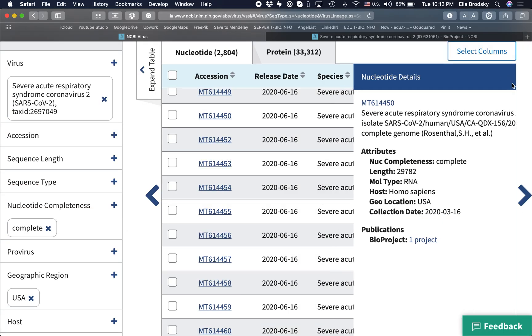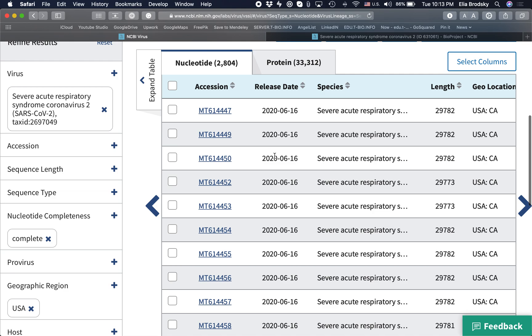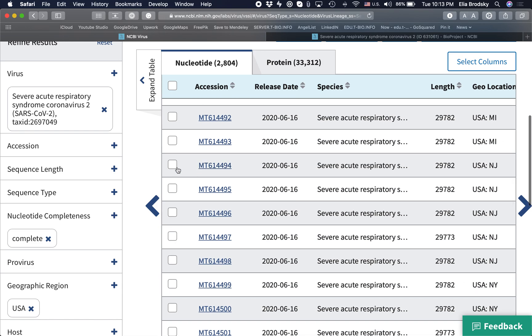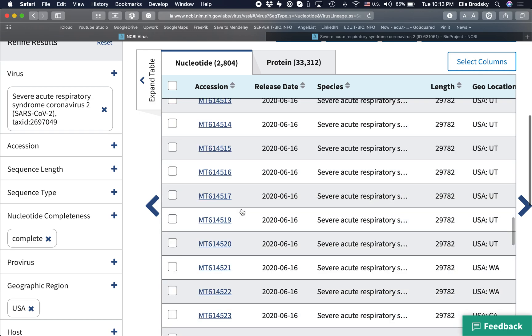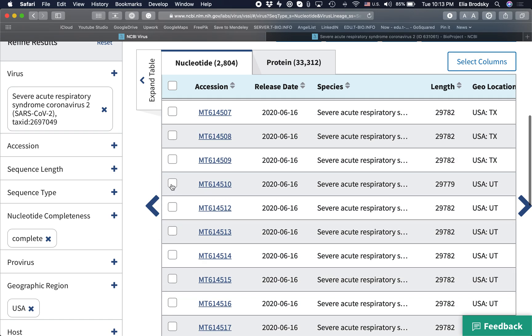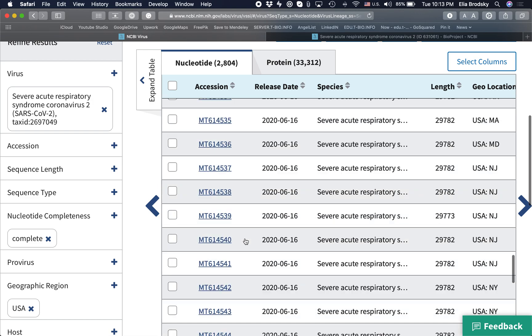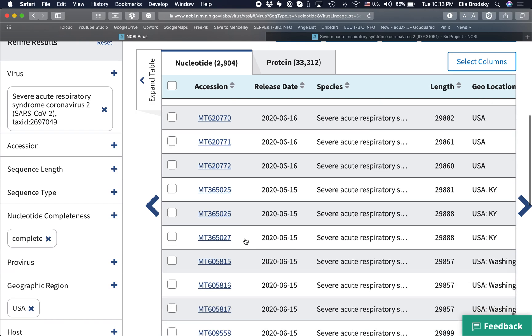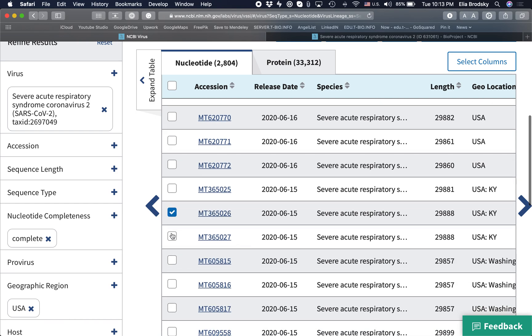You can also click on the BioProject to see how the whole sequence was submitted — for example, SARS-CoV-2 genome sequences from de-identified patient specimens submitted for testing at Quest Diagnostics. Now let's say we want to download a number of sequences — a few from California, a few from New Jersey, a few from Utah, and a few from Kentucky.